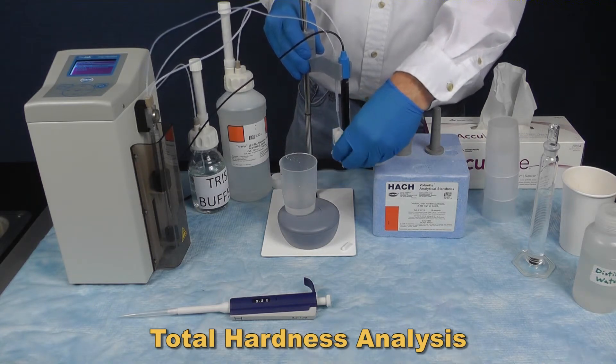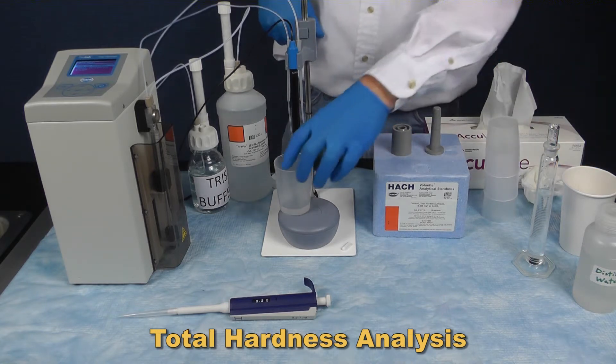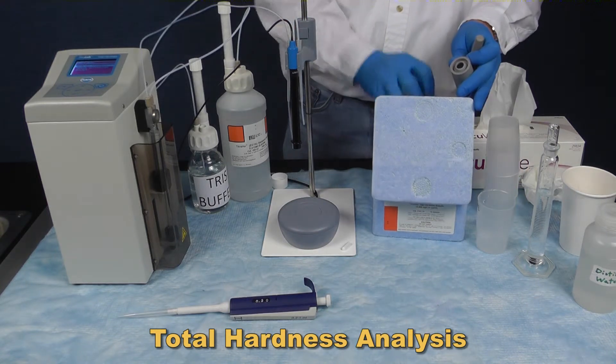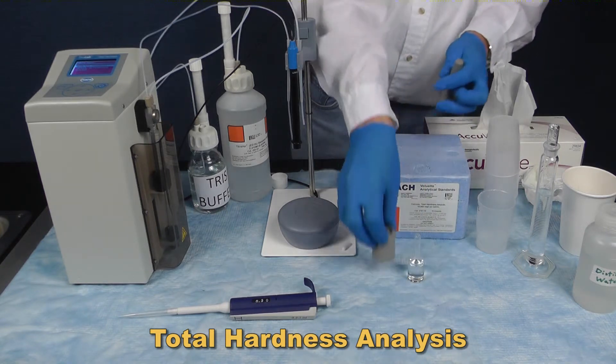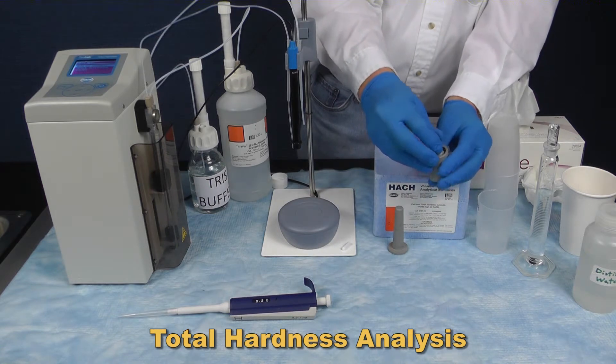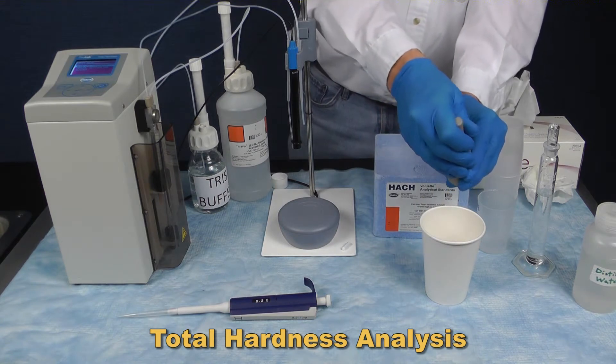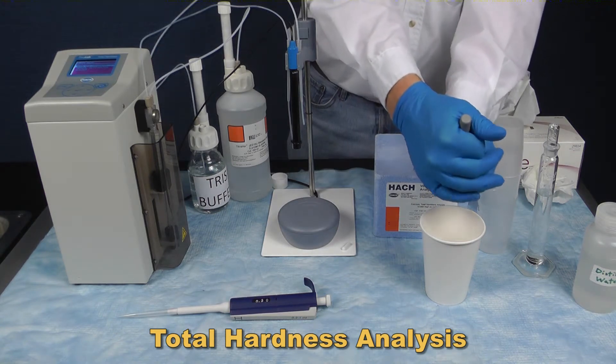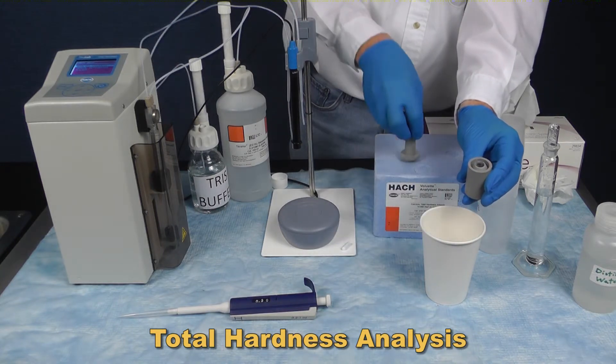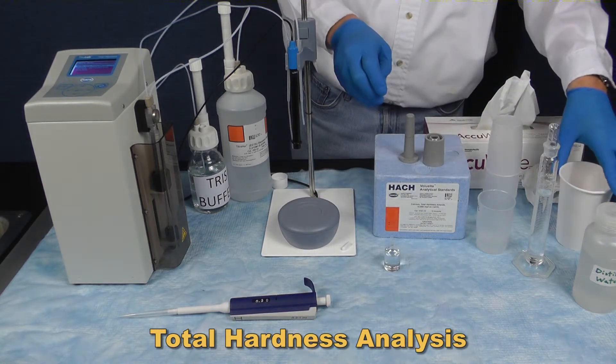To make the standard, break open a new ampule of the 10,000 milligrams per liter CaCO3 standard using an ampule breaker.